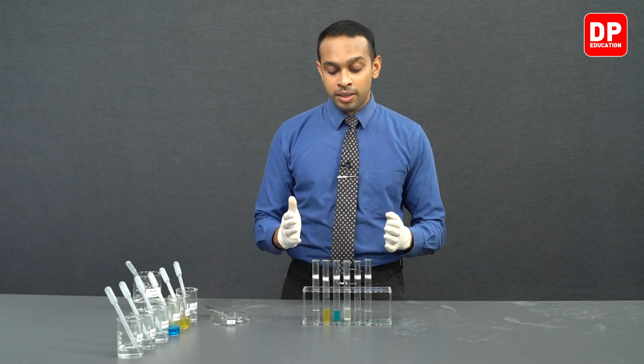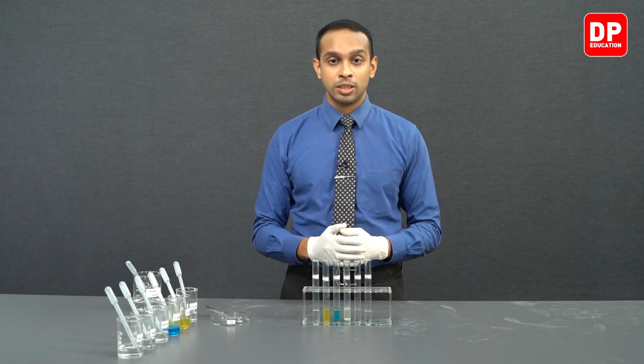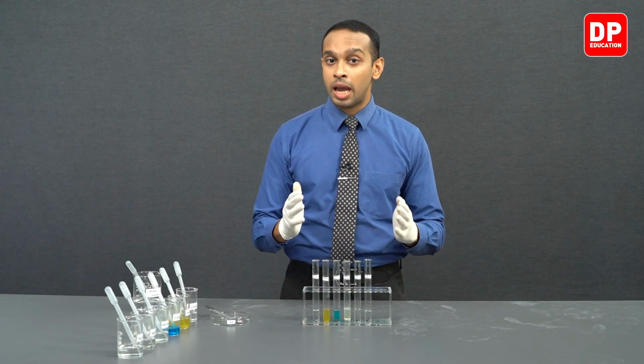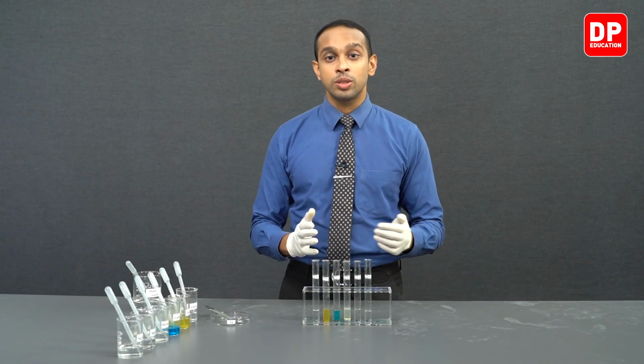So there are certain reactions that you should see. If you don't see those reactions, the reactions that should take place, if they are not happening, that is because you might have one of those problems that I mentioned earlier. Either the metal surface is not clean, or the reaction rate might be too slow. So at that point, you can speed up the reaction by heating the solution.